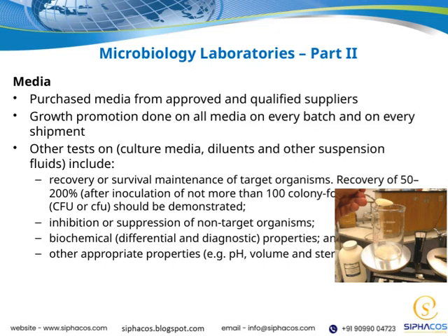We purchase media exclusively from approved and qualified suppliers, ensuring quality and reliability. It's also important to note that we perform growth promotion tests on all media, and we do this for every batch and shipment. This step helps us confirm that the media will support the growth of the target organisms consistently.